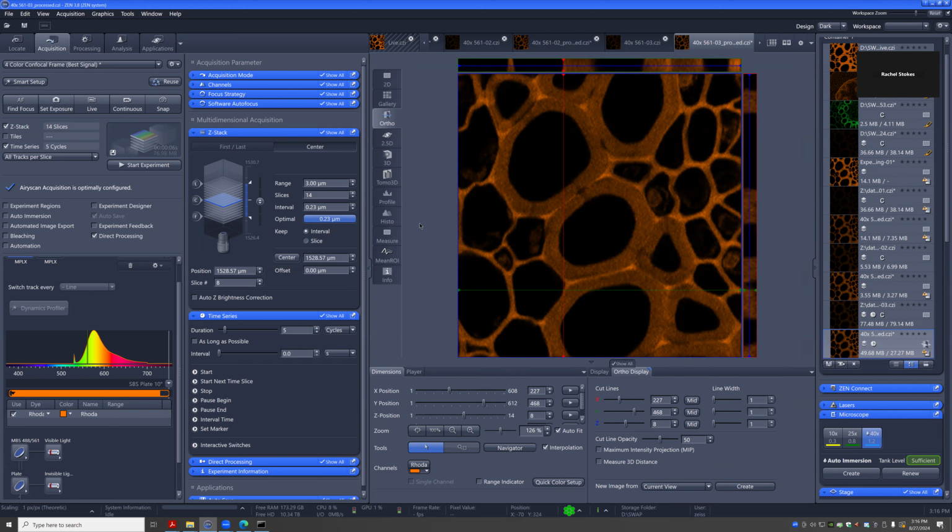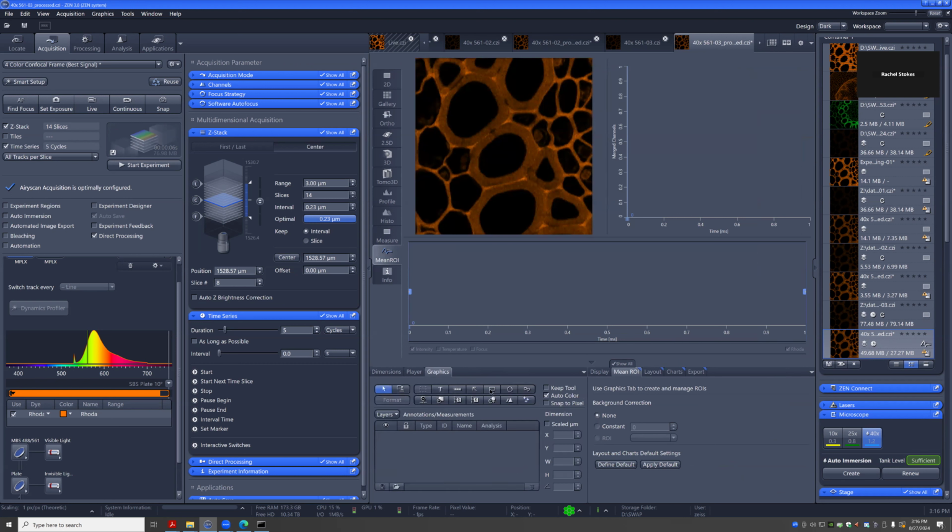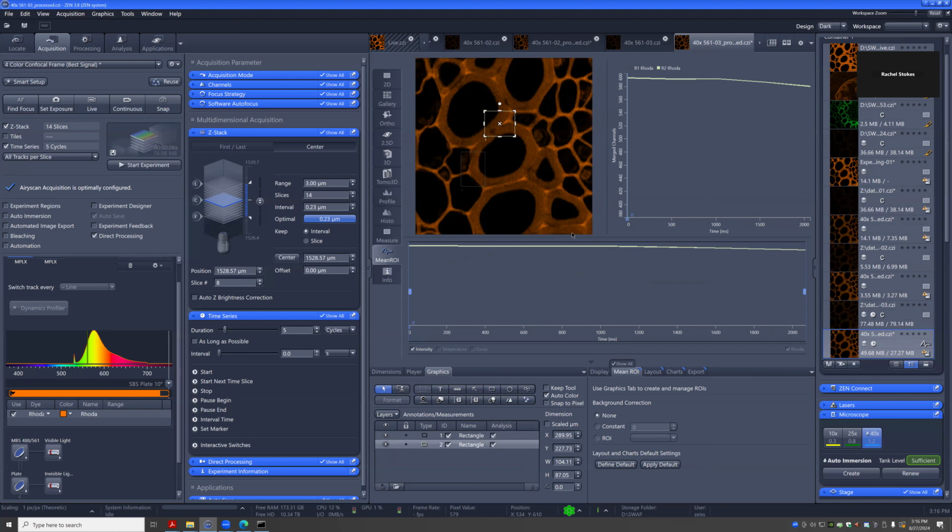If we also have a time lapse, it usually gives you this mean ROI. There you can track intensity over time. Say I just grab this little area here. Oh, they picked a stupid color. Let's do a different one there. So there you can follow intensity over time. That's where you see if something is bleaching. You can even do this during a time lapse, click mean ROI and track how everything is changing over time. But of course, this can only show up when there is a time lapse. So all of these are contextual to your experiment.